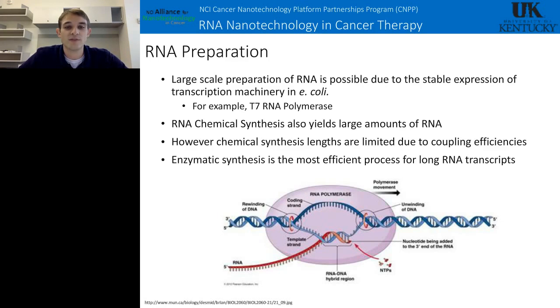However, after the in vitro synthesis, you're not only left with your target RNA strand, you are left with your proteins, you're left with NTPs that do not get incorporated into the RNA, and you're also left with your DNA template. So these all need to be removed from the transcription mixture before the RNA can be used.